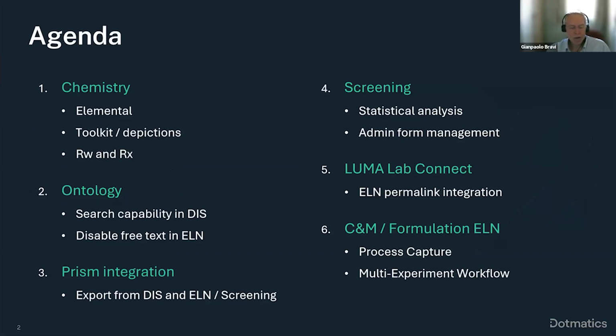At this point, I will pass the ball to Troy, who will cover integration between Prism and ELN, new capabilities for statistical analysis in screening, integration between ELN and Luma Lab Connect, and finally, enhancements to process capture and multi-experiments workflow.